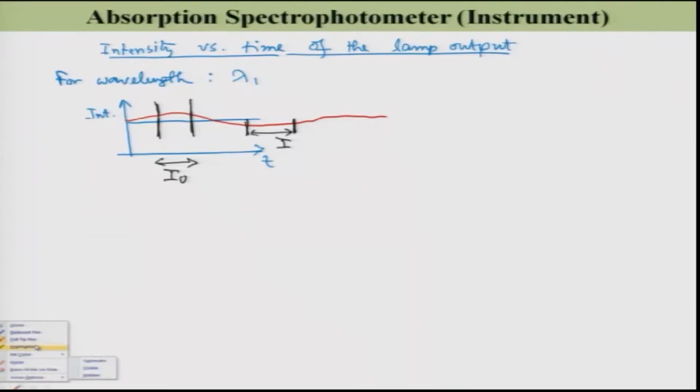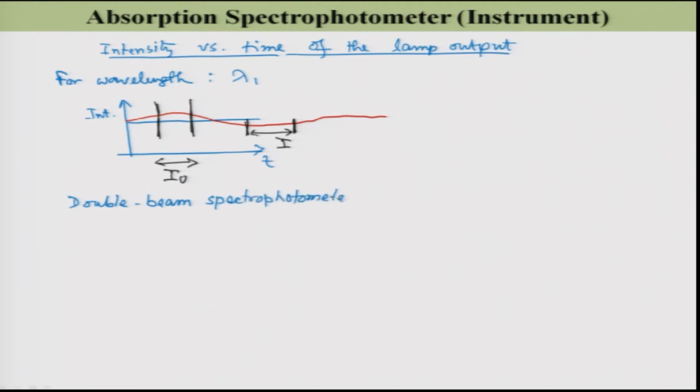So, in case of double beam spectrophotometer, how am I going to solve this problem?